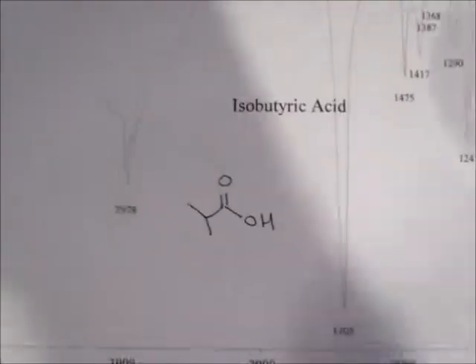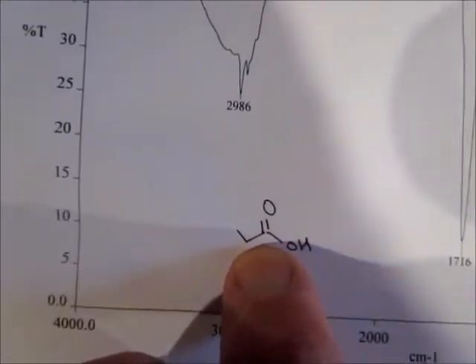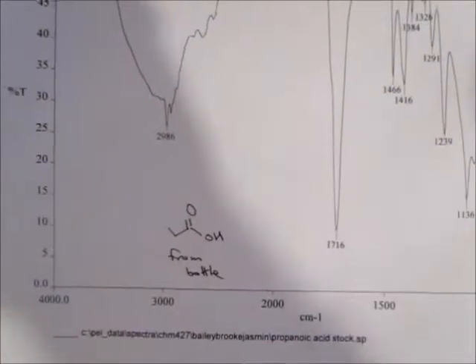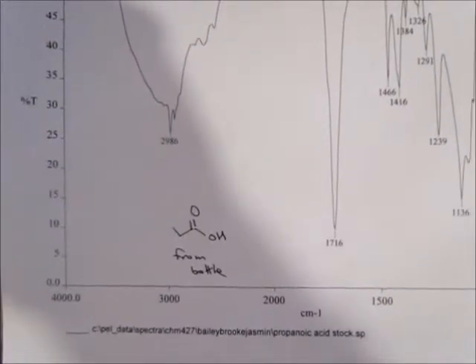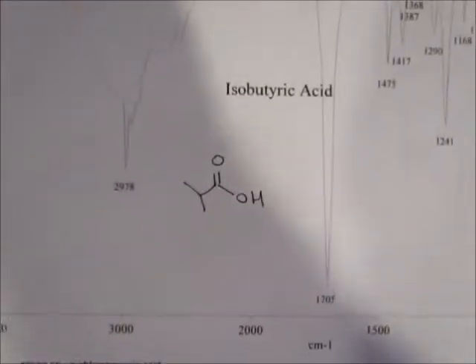In organic chemistry, a lot of times, one of the classic stories is, I found a procedure that used this compound, but what I want to do is use this compound. So in organic chemistry, we would say these two compounds are so close, we call them analogs. So with the exact same procedure, a lot of the observations and discussion content should be analogously the same. Certain things are very, very similar, like the IRs, for instance. The types of things you're going to circle are going to be the same. The proton and carbons can be a little different just because of the number of hydrogen signals. But the observations and discussion videos are going to stay the same, so you have to learn how to deal with that and analogously make your own.